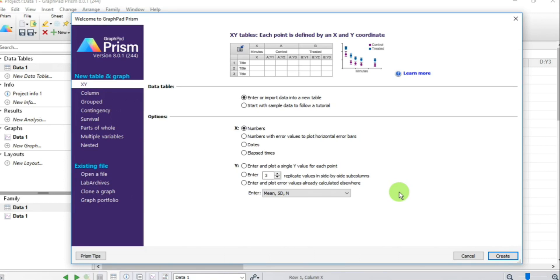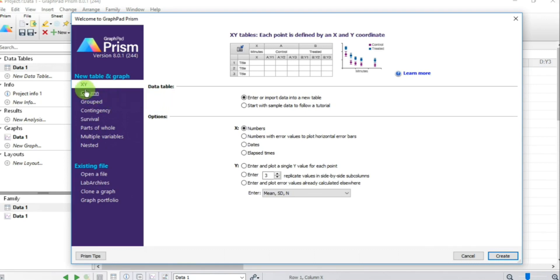The sigmoidal curve will let us calculate the EC50 or potency of our agonist. In the left panel we have a choice of different graph types. To draw a concentration-response curve, you need to choose the XY plot. Just leave the X values section for now.